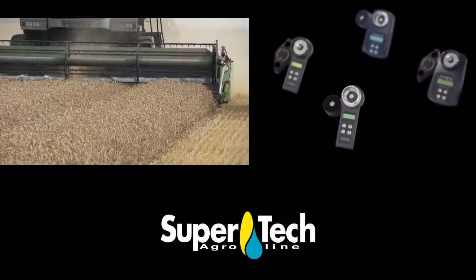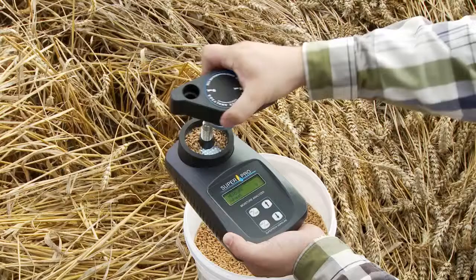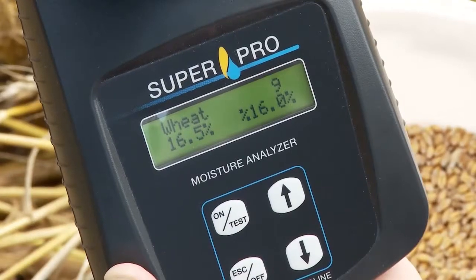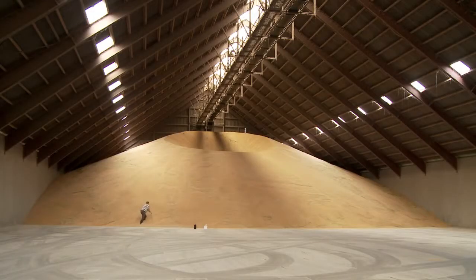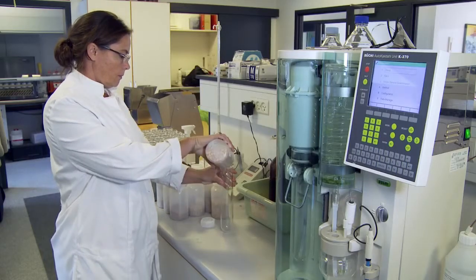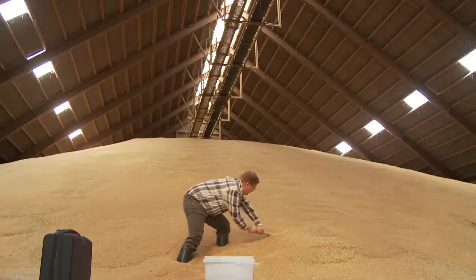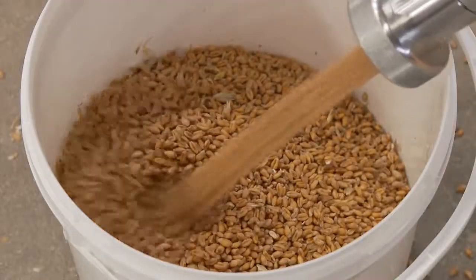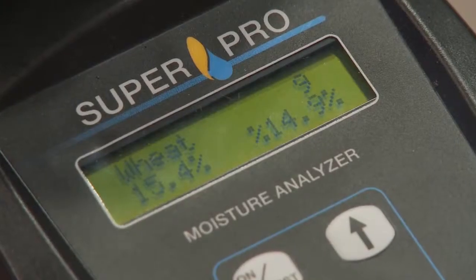SuperPro Moisture Analyzer is an easy way to determine the moisture content in crops, whether it is in the field before or during harvest, during the drying process, or afterwards in storage. This Danish high technology moisture analyzer gives you the market's safest measurement of water content in crops and seeds. Integrated automatic temperature compensation, grinding and compression of the sample gives a more reliable result every time.